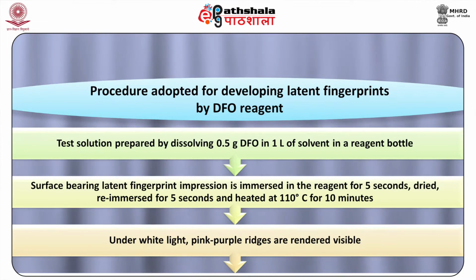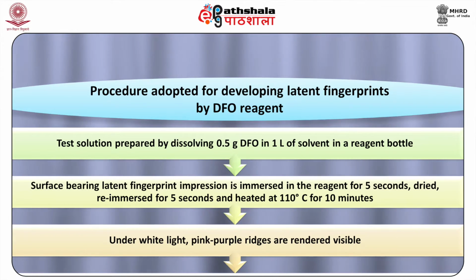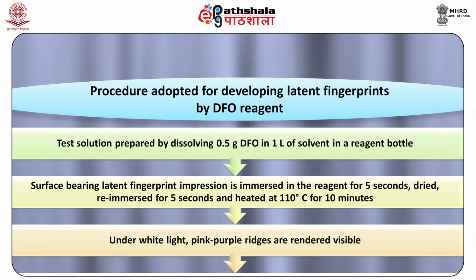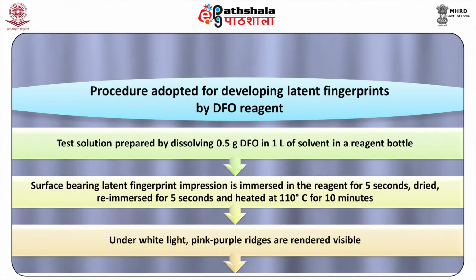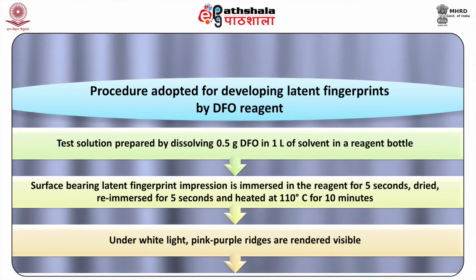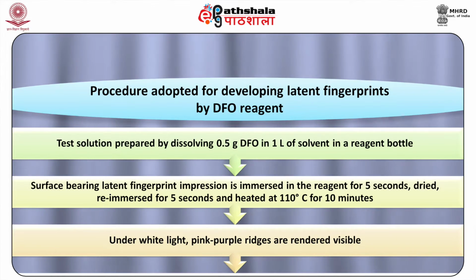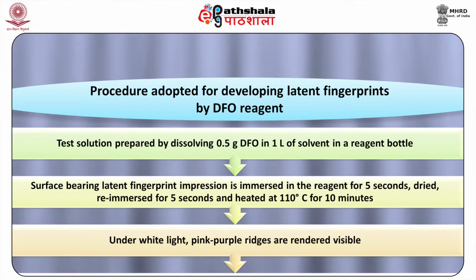The following procedure, subject to minor variations, is normally adopted for developing latent fingerprints by the DFO reagent. The test solution is prepared by dissolving 0.5 gram DFO in 1 liter of the solvent in a reagent bottle. The surface bearing the latent fingerprint impression is immersed in the reagent for 5 seconds, dried, re-immersed for 5 seconds, and heated at 110 degrees Celsius for 10 minutes.